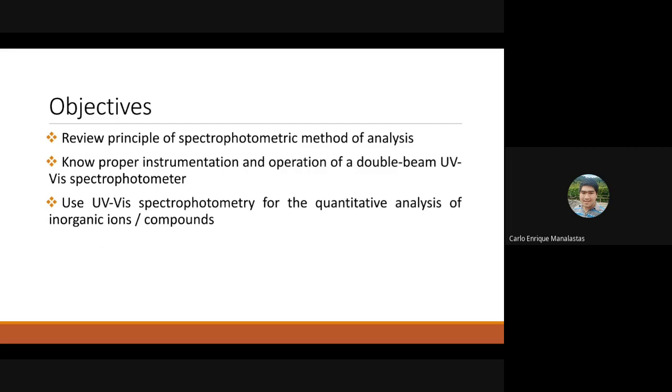And of course, the last objective of this experiment is for you to know the use of the UV-Vis spectrophotometer for the quantitative analysis of inorganic ions or compounds. So we will be applying here your knowledge on the Beer-Lambert law.